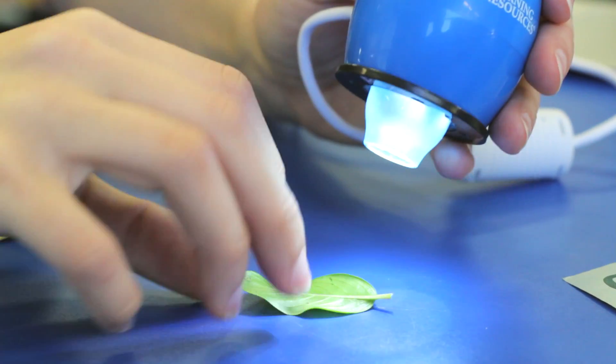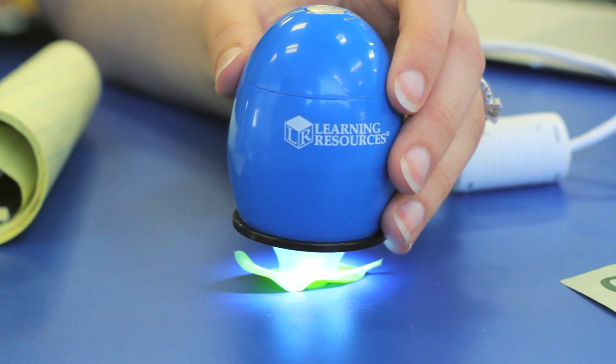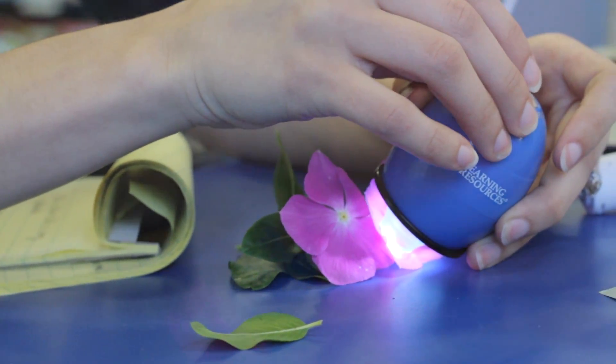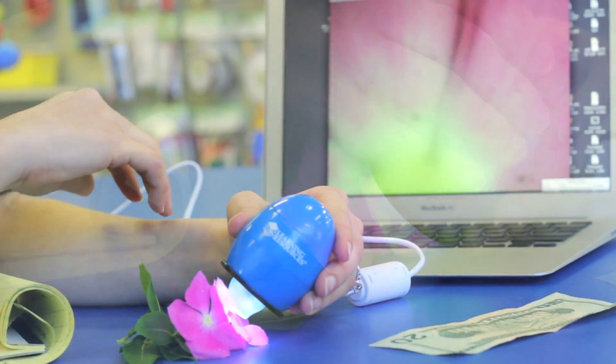The head adapters are designed to keep the perfect distance from the subject. To capture an image, just turn the top to focus until the image is clear on your computer screen and click.